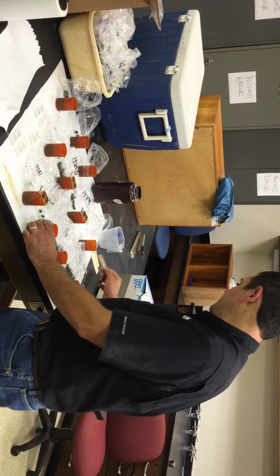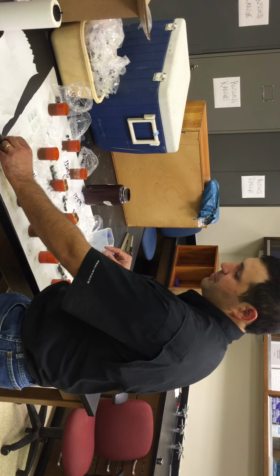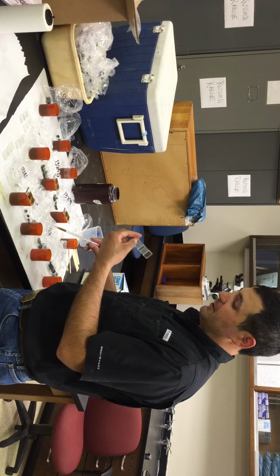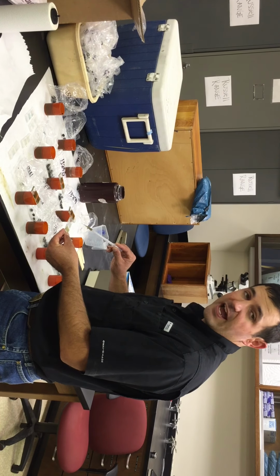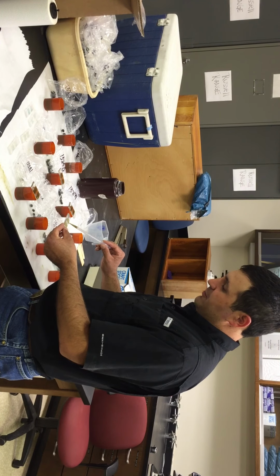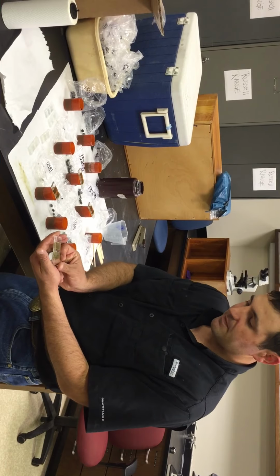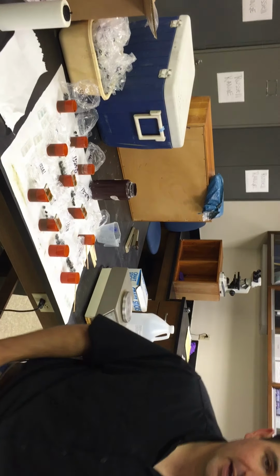We're going to mix it up really good, and then we're going to take a pipette, we're going to draw up some of that fluid, and we're going to put it on a McMaster slide, which is specifically designed for fecal egg analysis. So this McMaster slide has 2 sides. Each side has a little green grid on it, and that's going to allow us to accurately count the same area for each animal. So I've got that loaded on there, as you can see, okay, and we're ready to go. We've actually got one already loaded here behind Reed that we're going to show you.